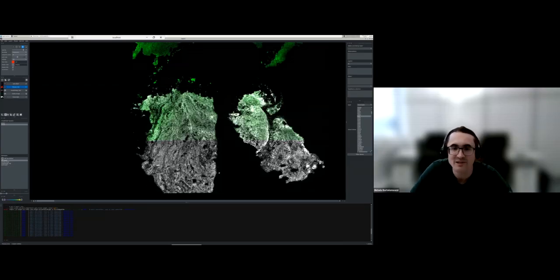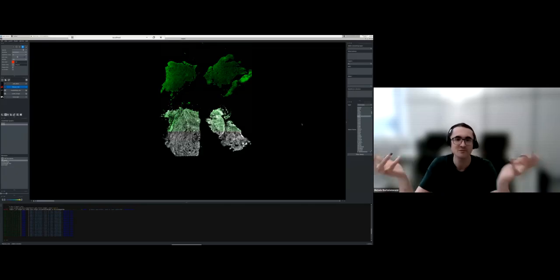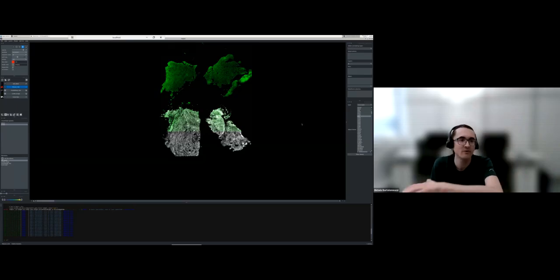So here we also have the aligned COMET image, and this is again thanks to the spatial data format structure, where I can not only save all the elements from the Xenium and the COMET dataset, but I can also save the transformation that is used to register one image, in this case the Xenium one, on top of the COMET one, and the same thing with the transcripts and the cell labels that I showed you before.